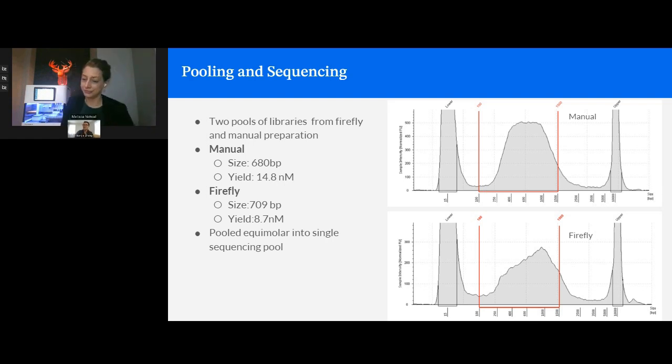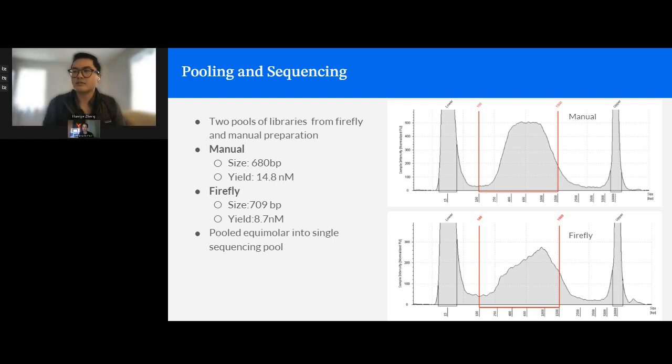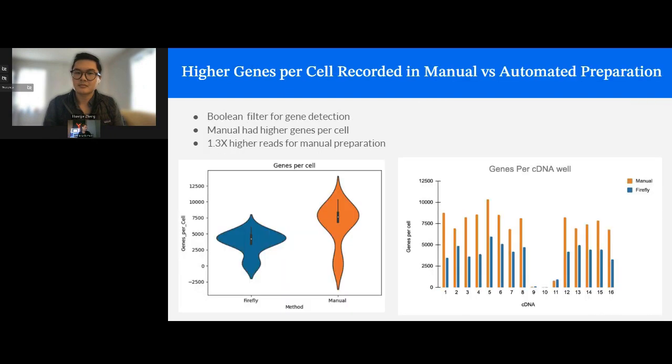Great, thank you. The next question is, what accounts for the gene count difference? Well, sorry, I think that question was just answered earlier, where I talked about the differences in the gene counts relating to variable sequencing depth. And yeah, I think this was just answered earlier.